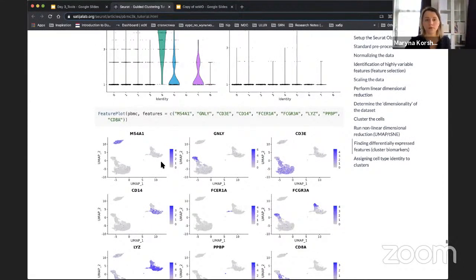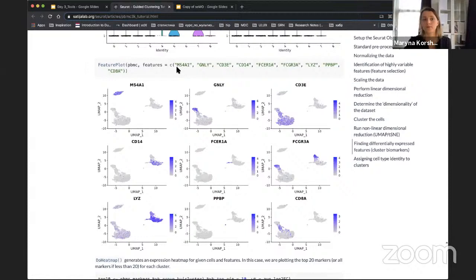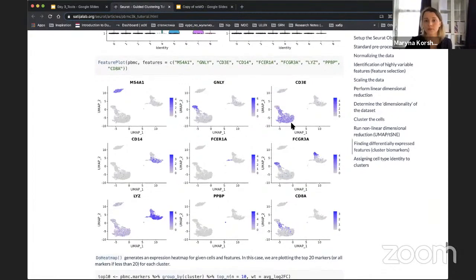We will talk about UMAP because t-SNE is quite an old-school way of visualizing and processing, a nonlinear dimensionality reduction method. So what you can do is highlight the cells which have these genes. You insert the vector of genes in your data set and understand if this gene is cell type specific or not. So that's in brief.